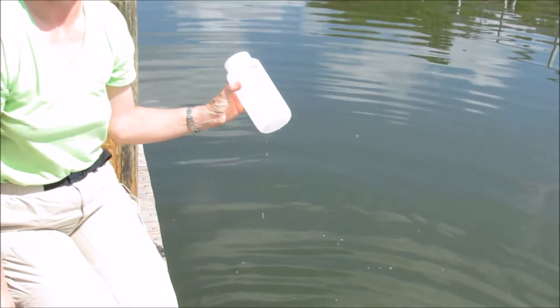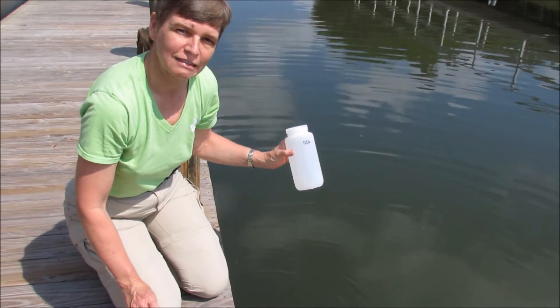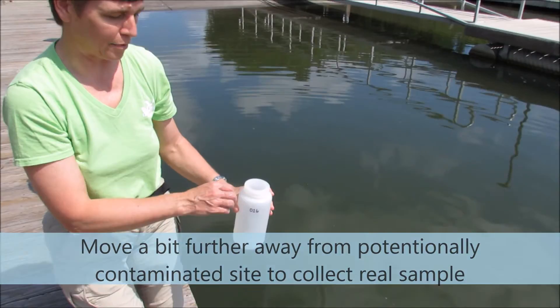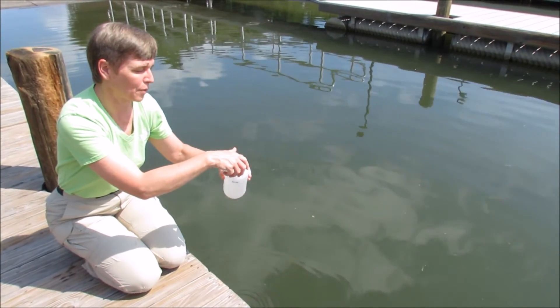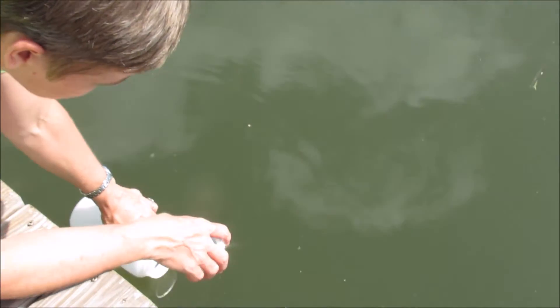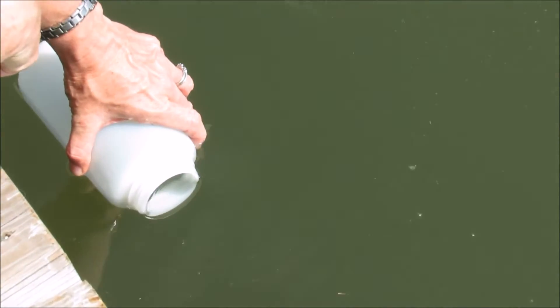Our bottle is now ready for us to collect our sample. We want to move just a little bit away from where we dumped that potentially contaminated water to collect our real sample. We're going to hold the bottle horizontally, parallel with the surface of the water, and just carefully lower it down into the water, collecting the water right at the surface.